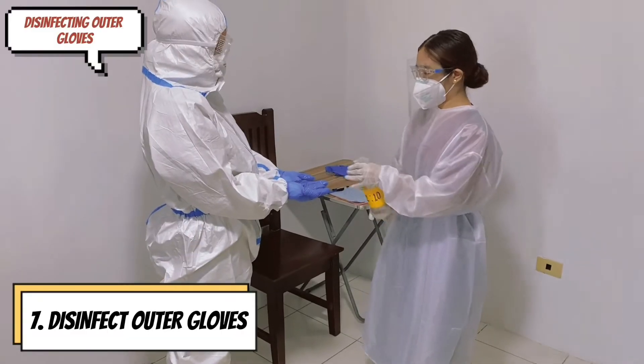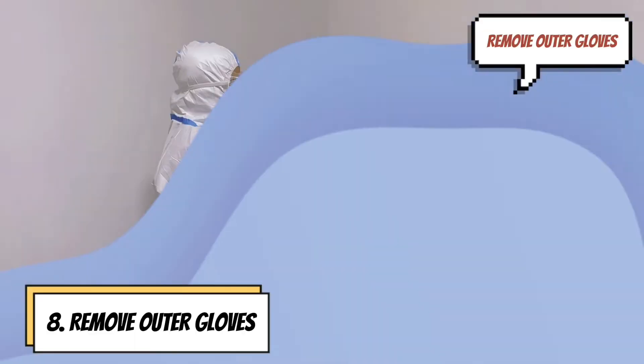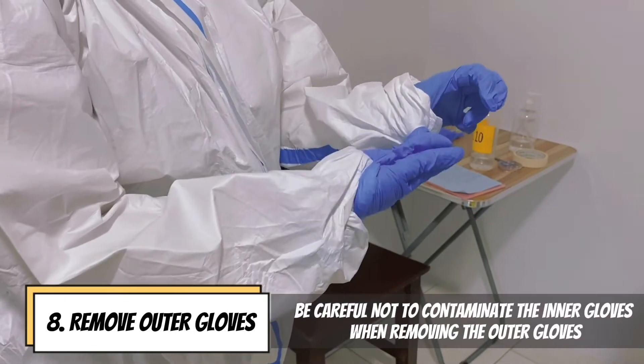Disinfect outer gloves using a 1-to-10 bleach disinfectant or an alcohol-based hand rub. Be careful not to contaminate the inner gloves when removing the outer gloves.